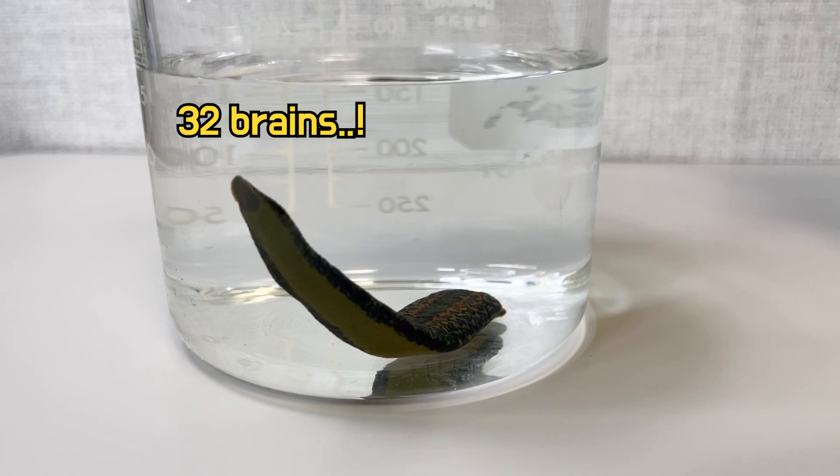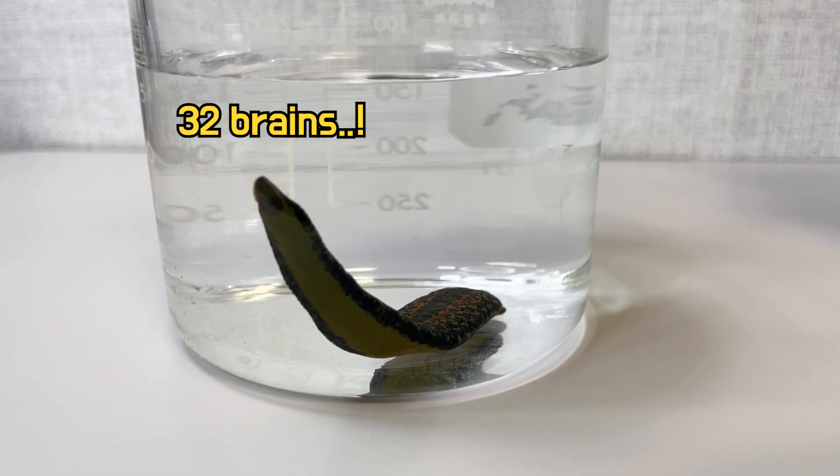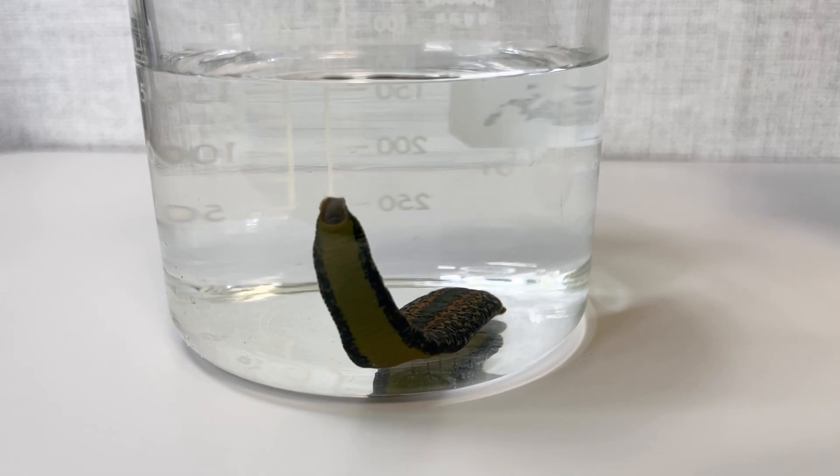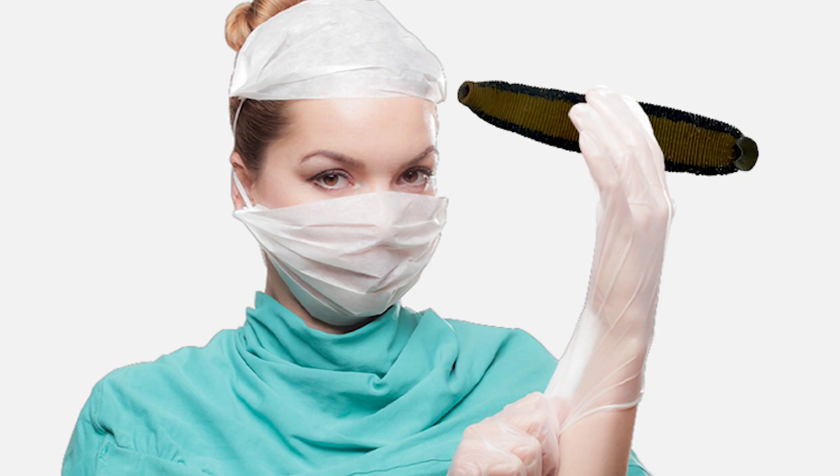Leeches are sometimes referred to as organisms with 32 brains. Fascinating, isn't it? That concludes the leech dissection. If you enjoyed watching, please consider subscribing.